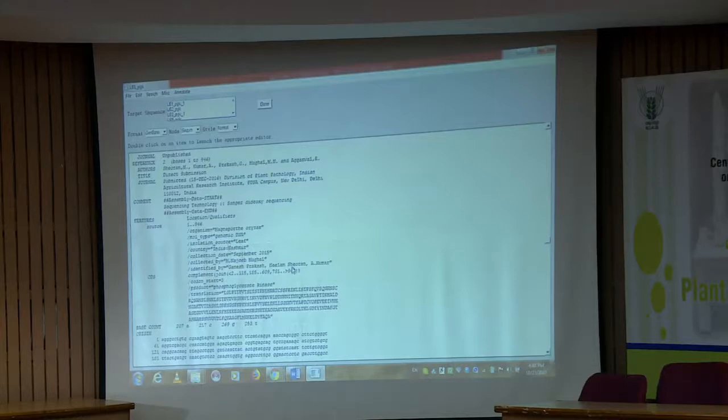This is for all types of genes, whatever gene sequences we are submitting. Although for journals like bacterial identification and fungal identification, we do not have to specify because that is the universal marker only, but if you are going gene-wise, then you have to specify this, right.